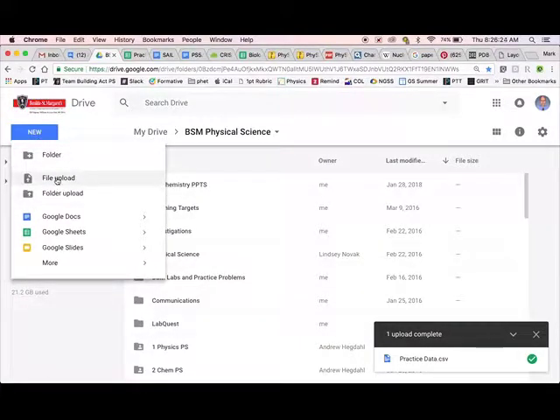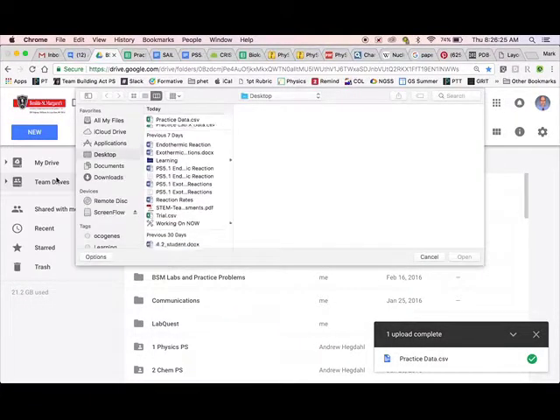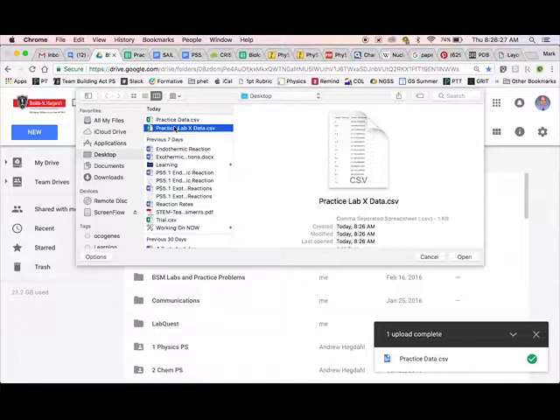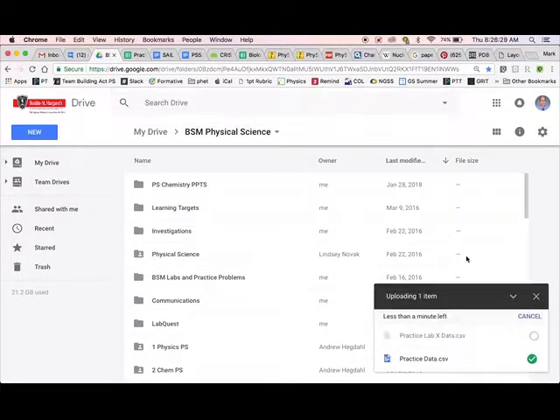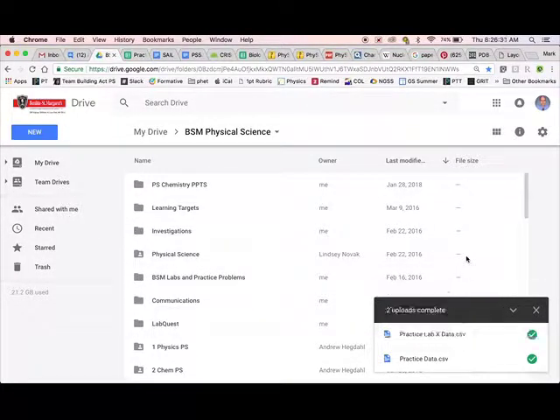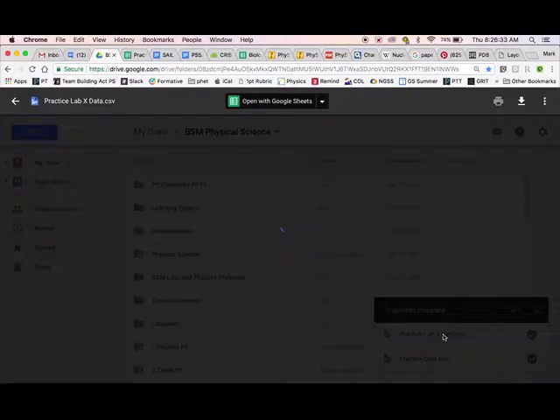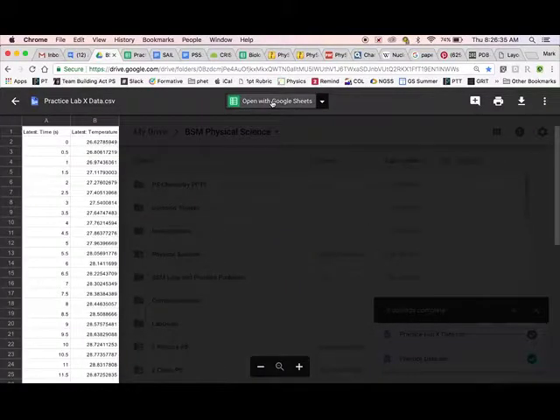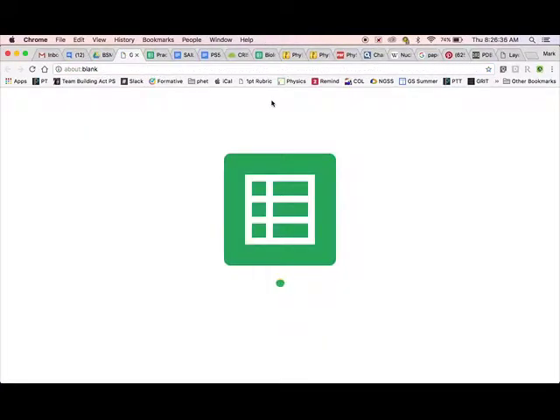So Google File Upload. Find that. We go practice lab X data. There's the CSV. I'm going to upload it. Now it's going to take a second or so. Now it's going to convert it. I want to open it with Google Sheets. This shouldn't take too long.